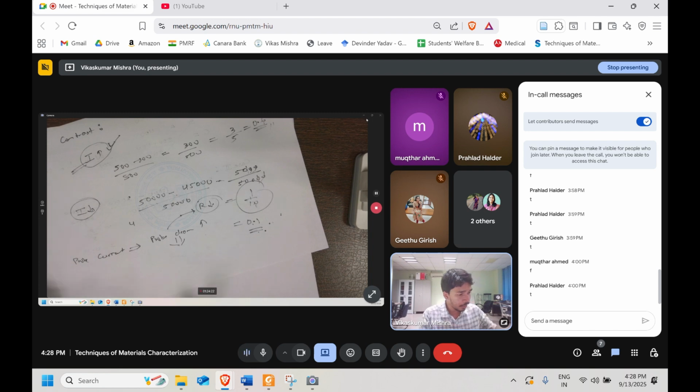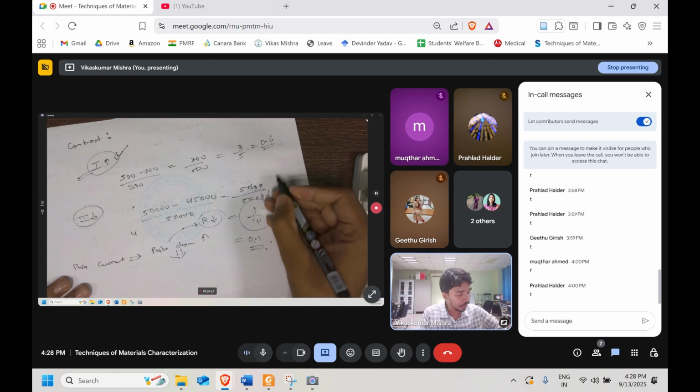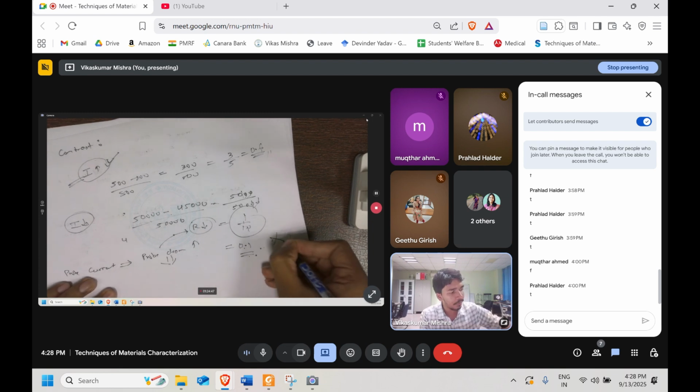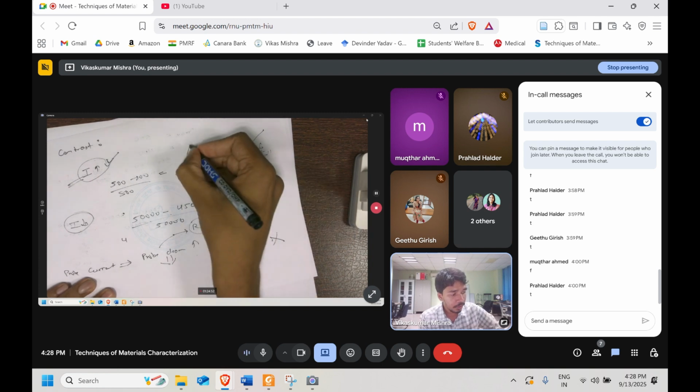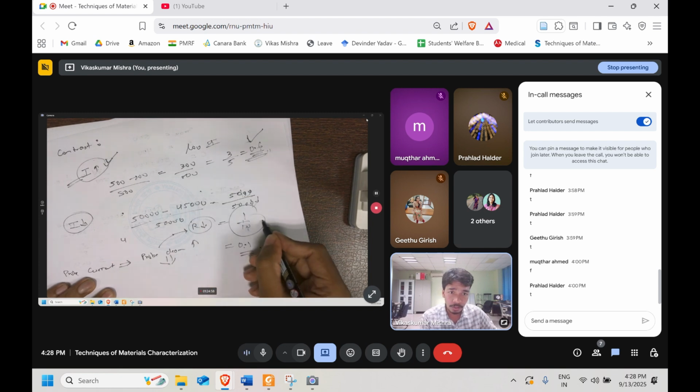that I think is by Barry Carter. In the first part of it, they have signified the difference between these two things. In the first case, they are telling that if the background intensity itself is increased by a certain value, and you keep on increasing the current, the contrast between the two regions will not be sufficient for you to see, because our eyes are sensitive only to a certain extent. So we might not be able to detect this. Okay, so low current is giving the better contrast, high current is giving the poor contrast.